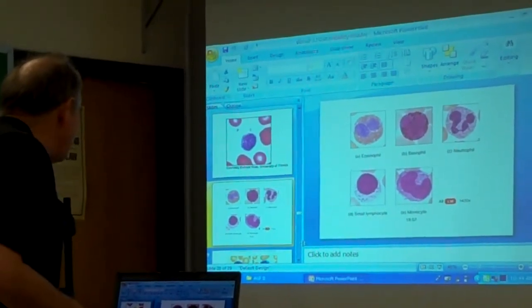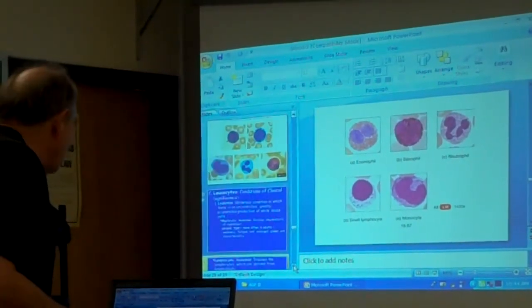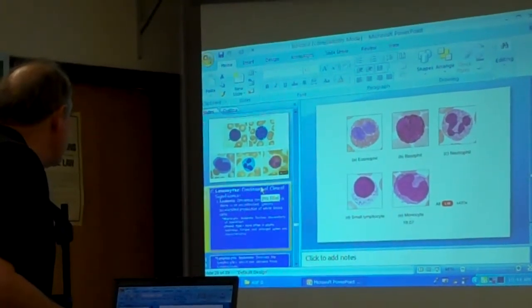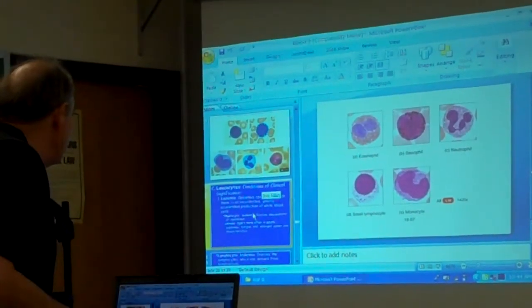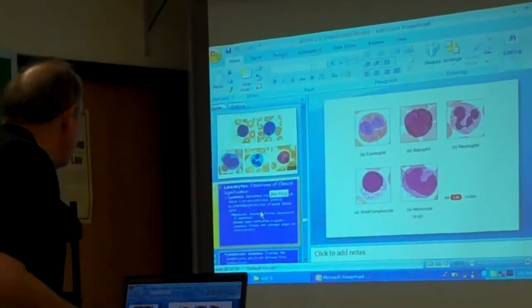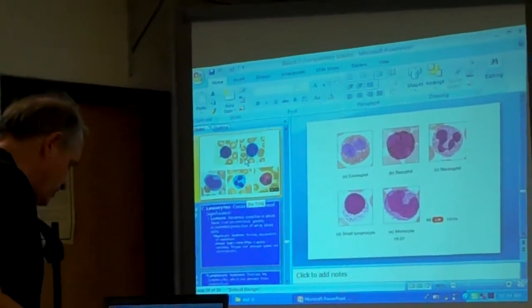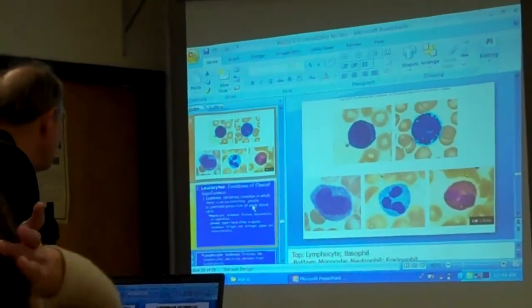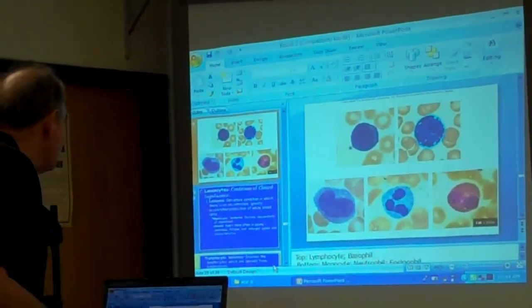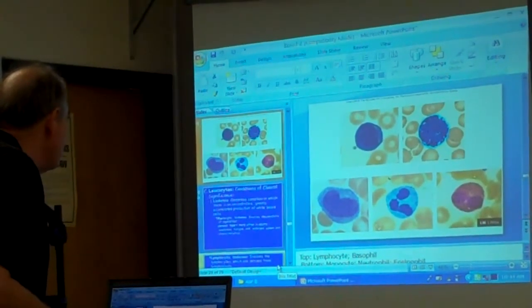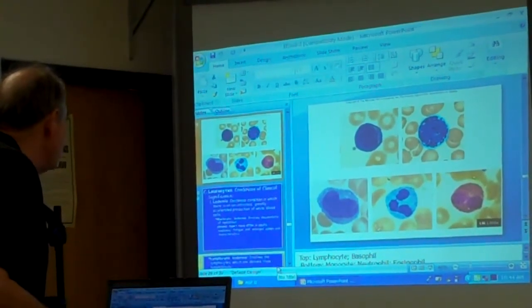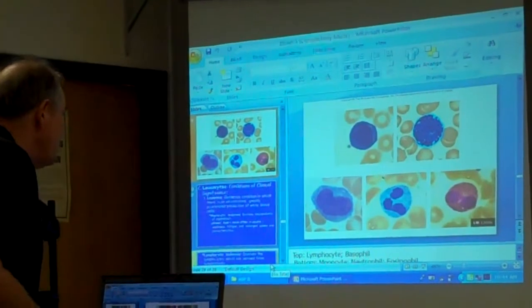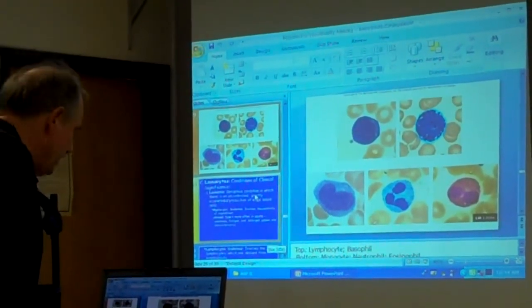And then this next slide right here on these lymphocytes — that's just a different slide right there. Top is a lymphocyte, basophil, monocyte. The bottom is a monocyte, neutrophil, and eosinophil on the bottom. So that's just kind of showing you — you don't have to memorize it.